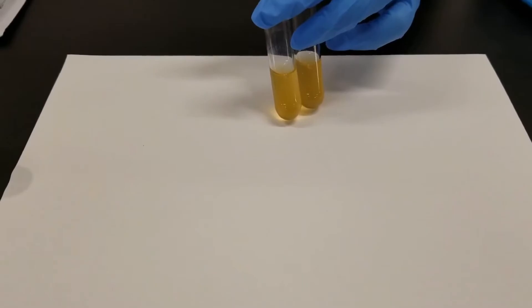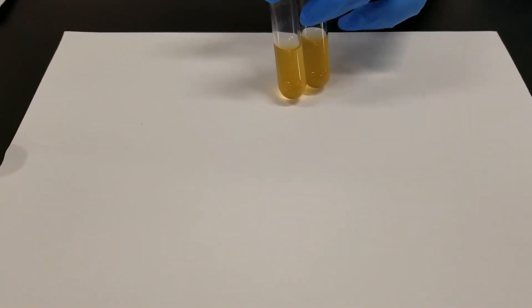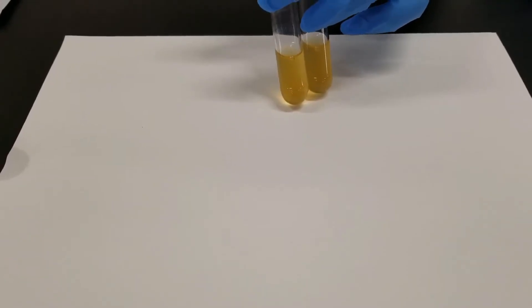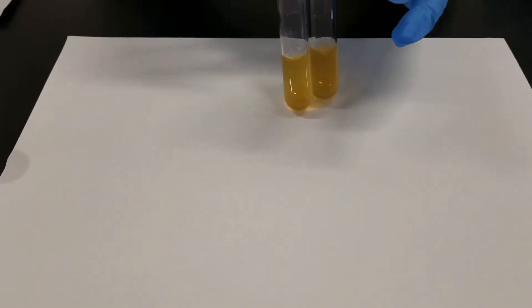This is part of the IMViC test, this is the methyl red test portion of it. This is testing for the ability of the bacteria to ferment glucose and produce large amounts of acid.